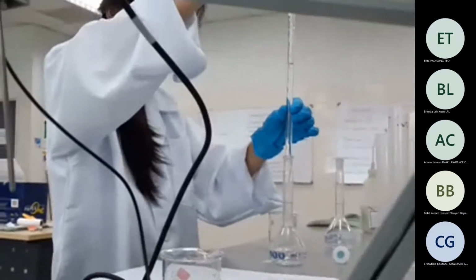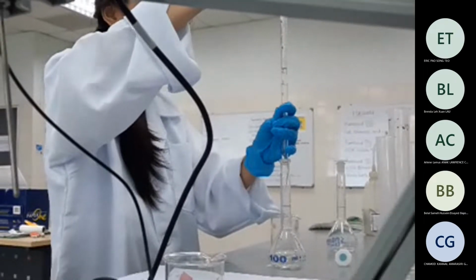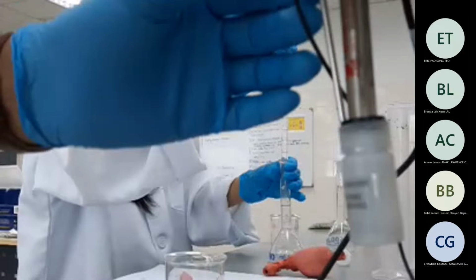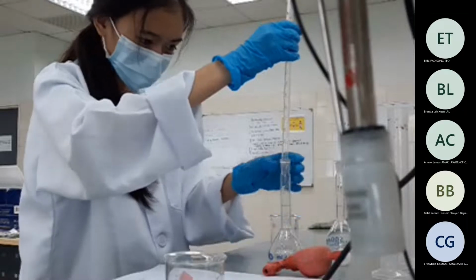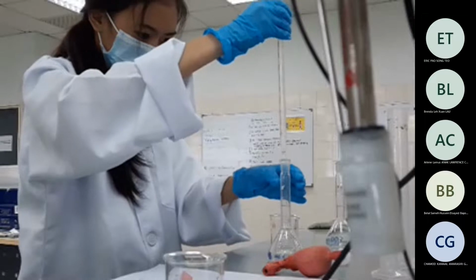Now, guys, you can see Noor is doing her work. Be careful with the probe because the probe is very sensitive. So what are you doing, Noor? HCl? Okay.